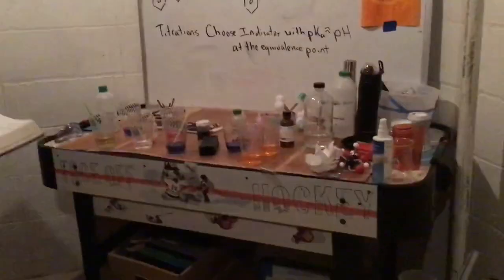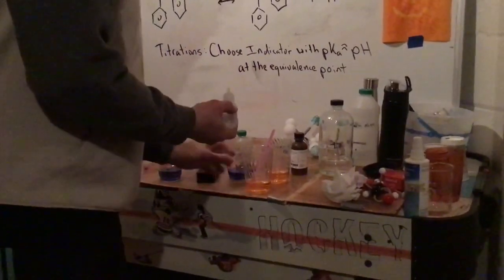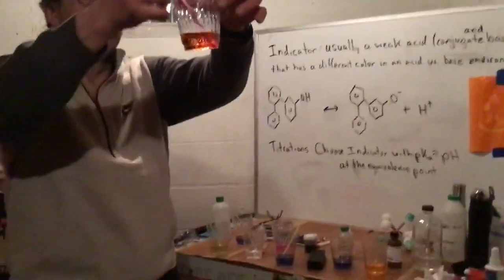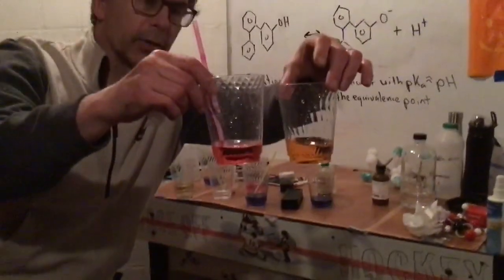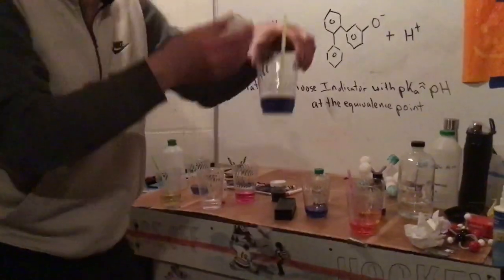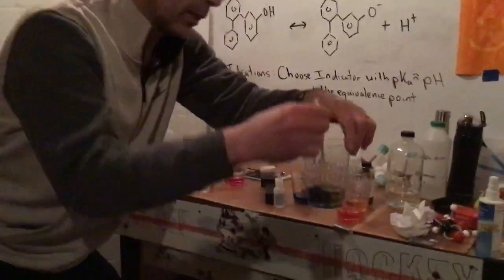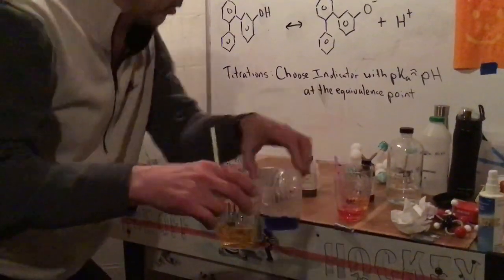We'll just show you that by adding an acid to those things. We'll grab some HCl, throw it in here, and this will go from orange to red. And this one is the bromocresol green. If I add more, we get lower down here so you can see it, and that will go to a really dark yellow right there.